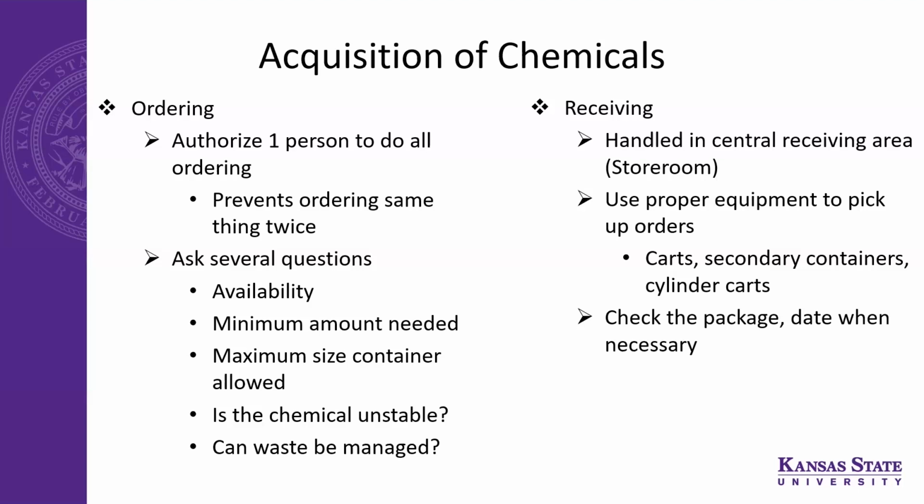spend extra time, you'll have to contact EHS, you'll have to submit the waste pickup request. If the chemical needs special handling, even the EHS will have to hire professionals to get rid of that. I have the experience, so that's why I'm talking. So please think about all these facts before you purchase a chemical. And we talked about the size of the container. There will be limits based on the class of the chemical to be stored in a particular lab. So pay attention to that as well.